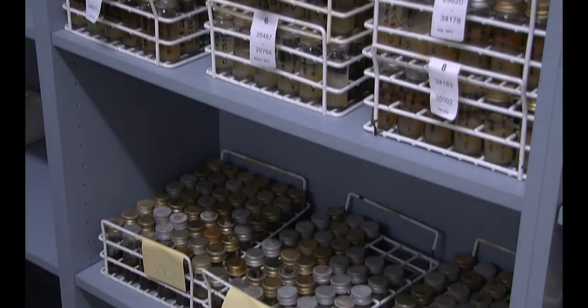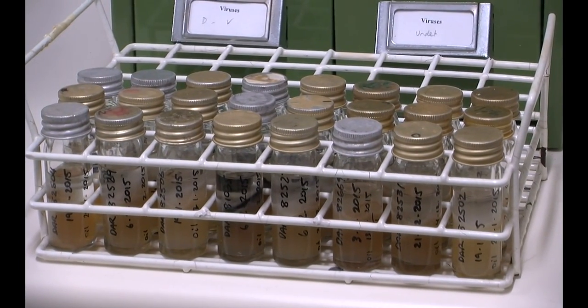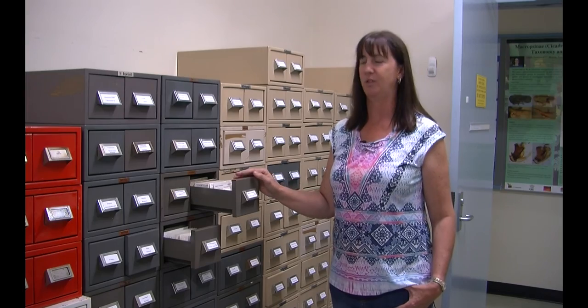A disadvantage of the mineral oil technique is that the cultures' characteristics can change over the years. A newer method — probably in use for the last 10 to 15 years — is storing the mycelium in a minus 80°C freezer in a special preservation liquid. We don't yet know exactly how long they'll last, but it looks very promising. Unfortunately, some fungi don't tolerate the two newer methods — freeze drying or microbanking — so we still have to use mineral oil for those, which is quite labour-intensive. This room is kept at a constant temperature and humidity to help the cultures survive long term.